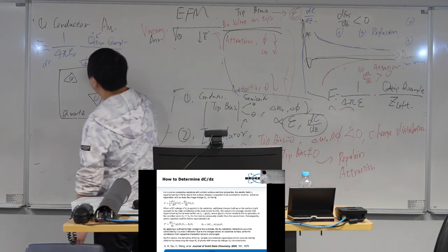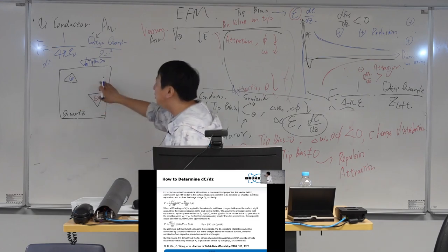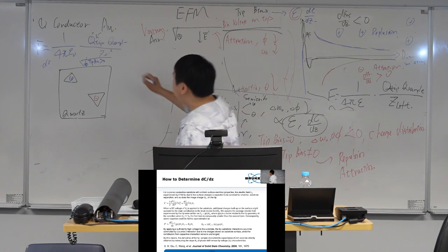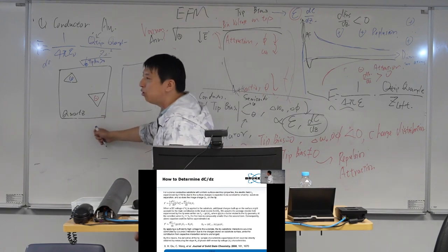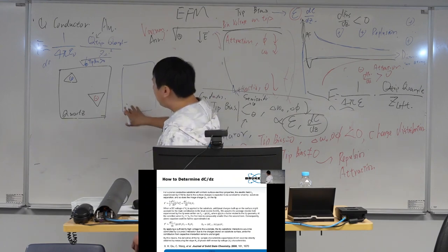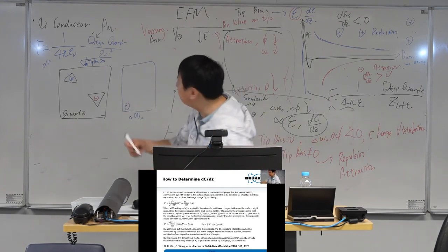And then this probe is positive charge. And then I use it to scan these samples. And I will get on the quartz, because it's no charge, the frequency shift on the quartz will be 0, right?